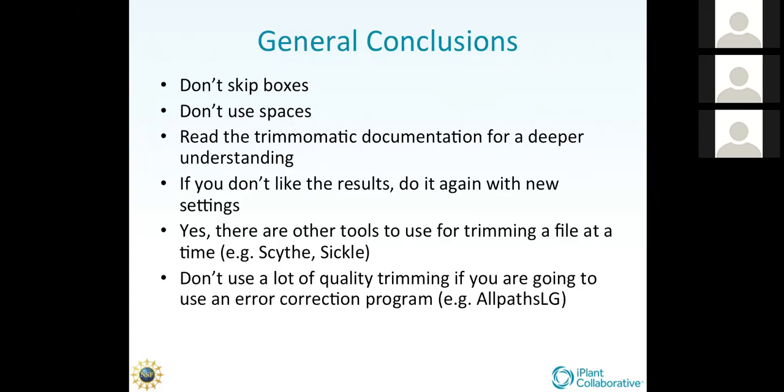And you also notice here, I point out something: most of the time we think of getting rid of the bad data, and erring as much as possible towards having totally clean reads. But under some circumstances, you'll get better results if you're very sloppy, let's say, or err towards the dirty side of things when it comes to quality trimming. And that's because sometimes you lose depth of coverage, or you lose what may be a hard to cross stretch of sequence that may end up looking like it has lower quality, but it's an important stretch of sequence within a genome, for example.